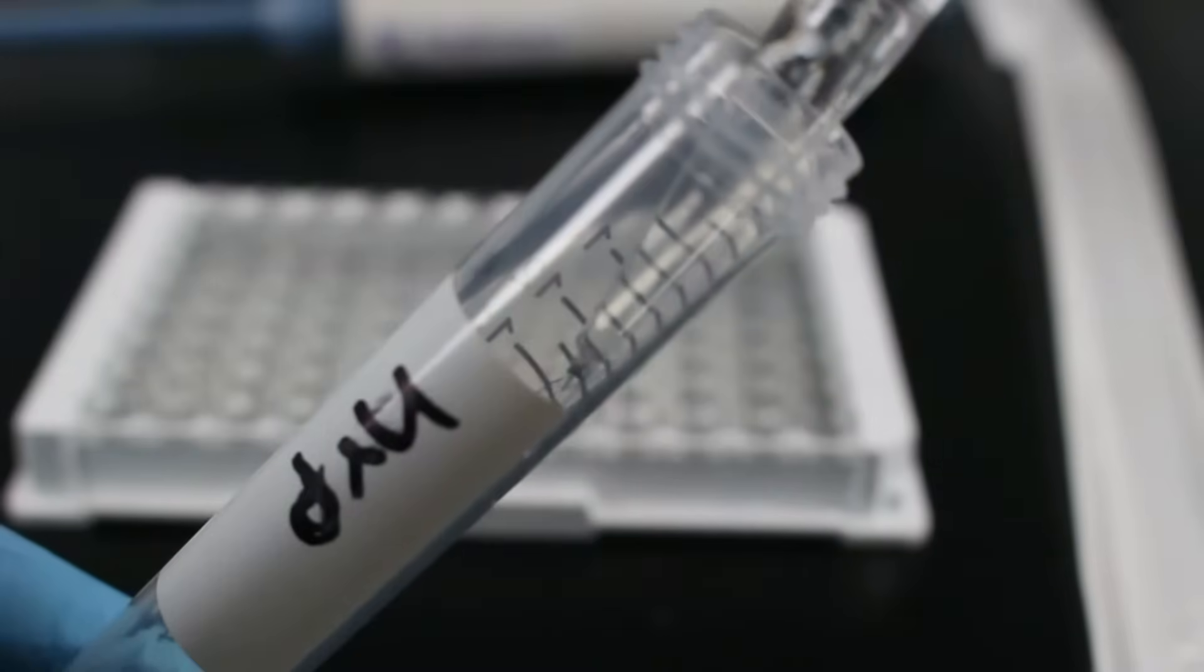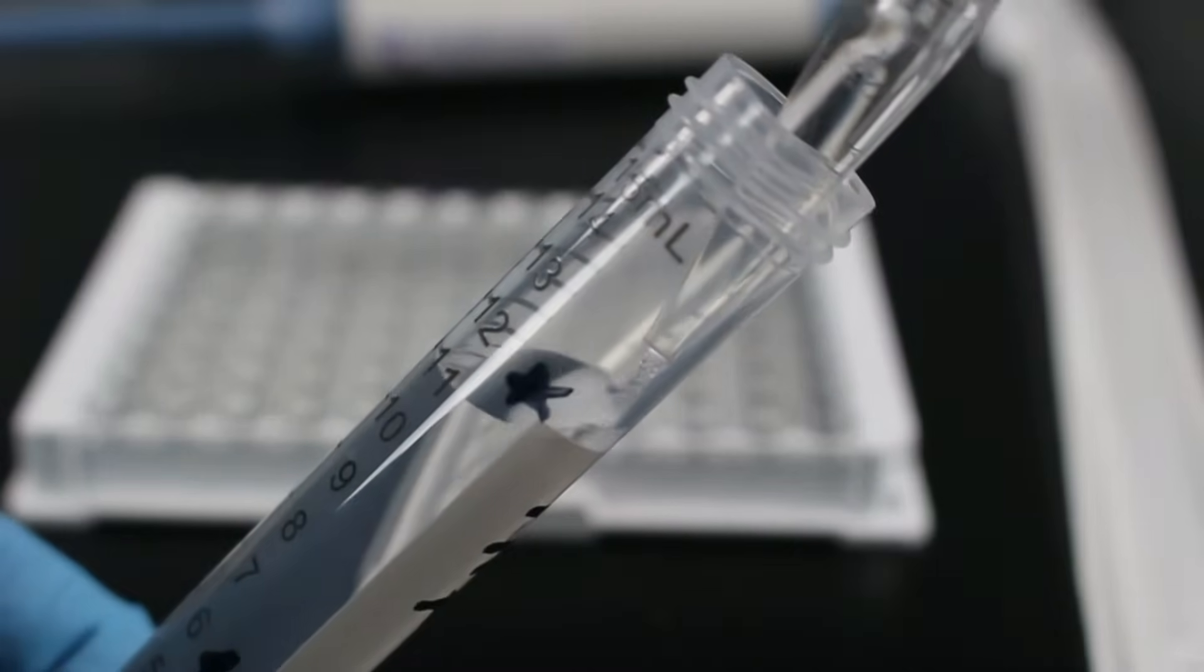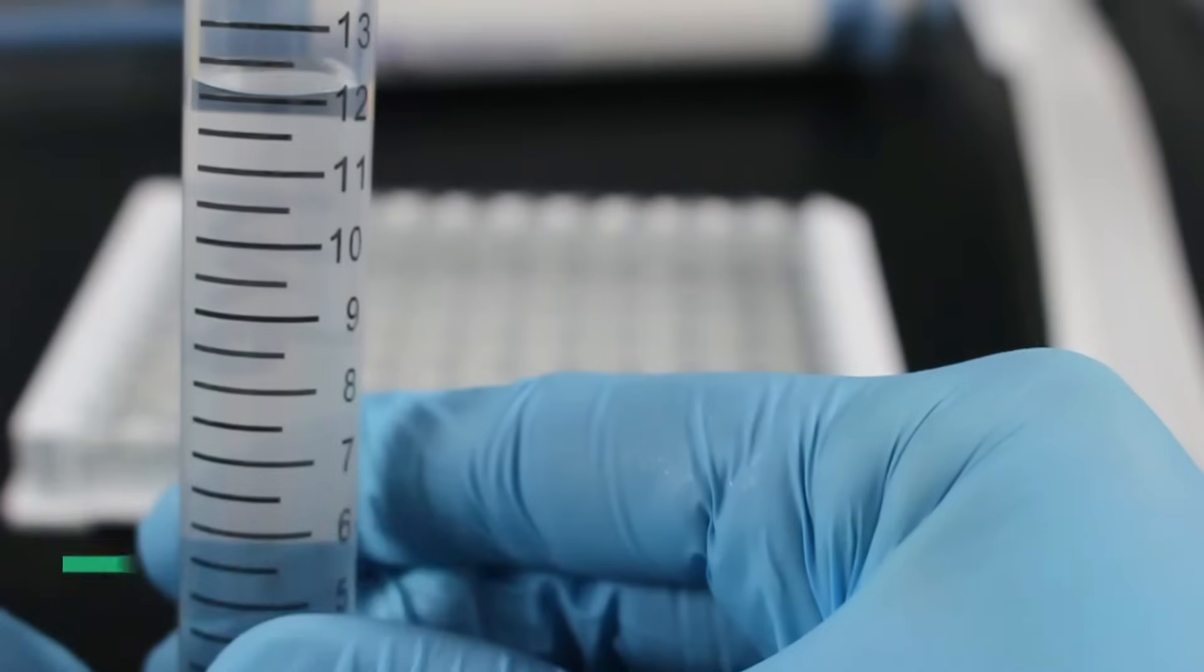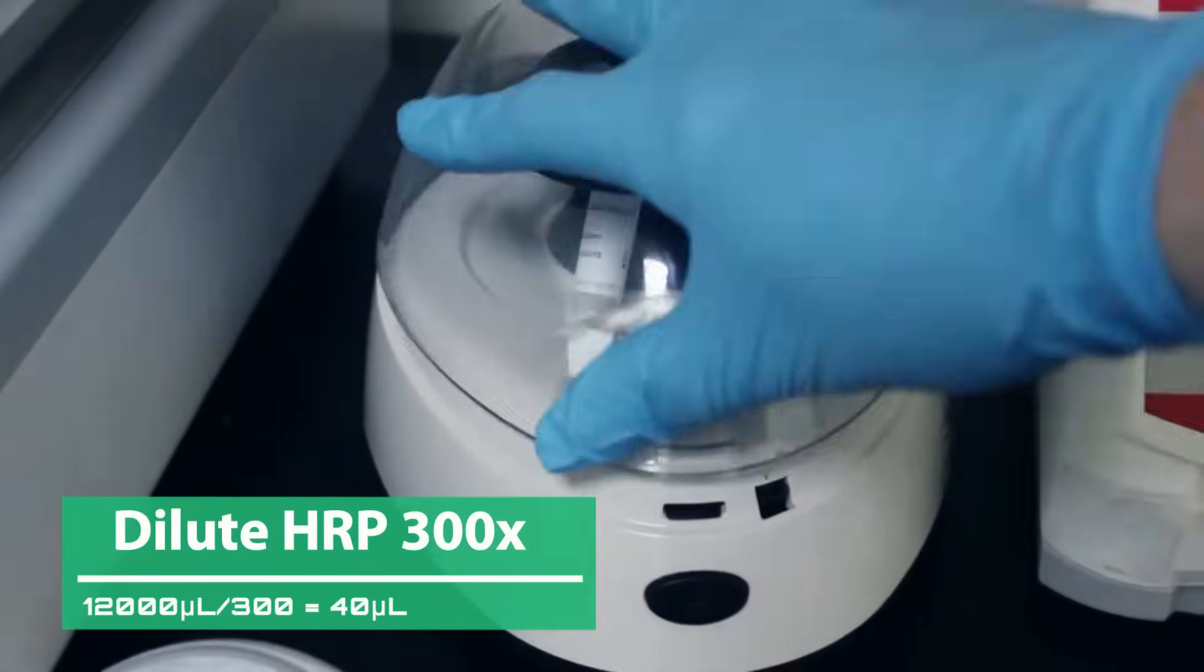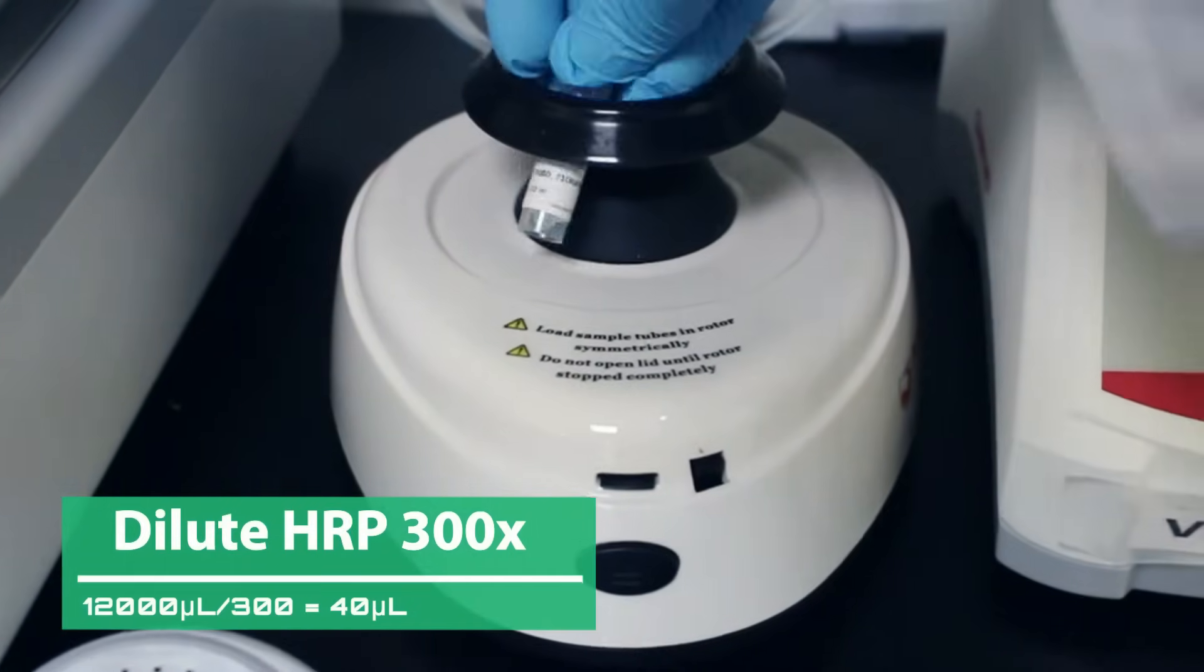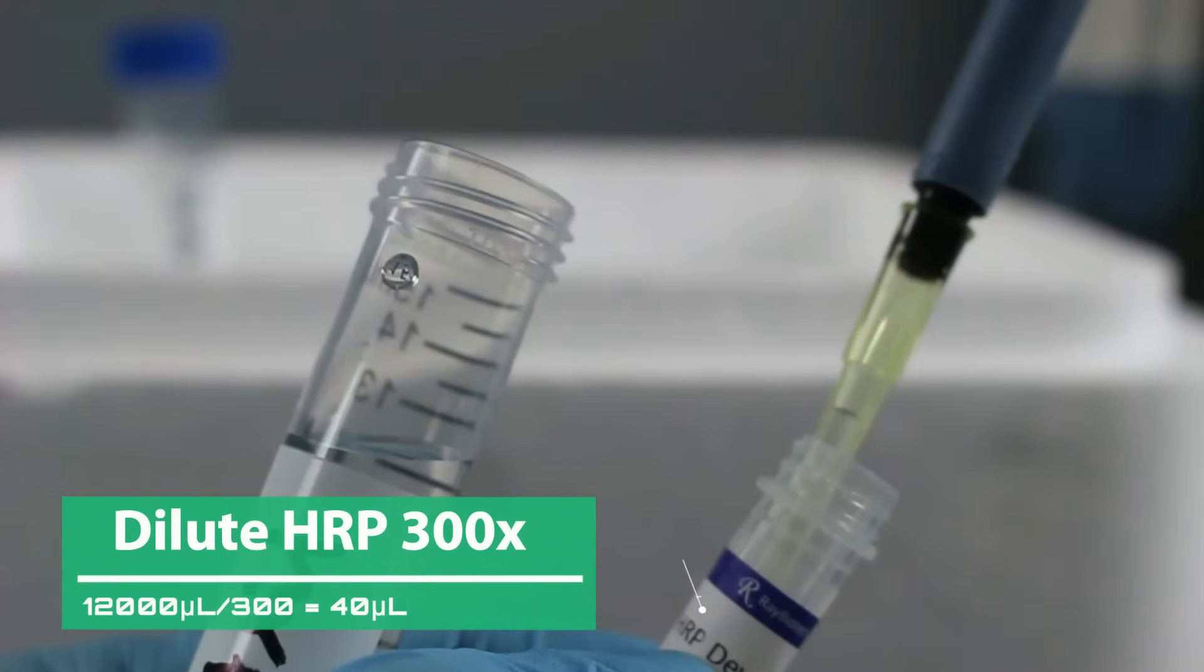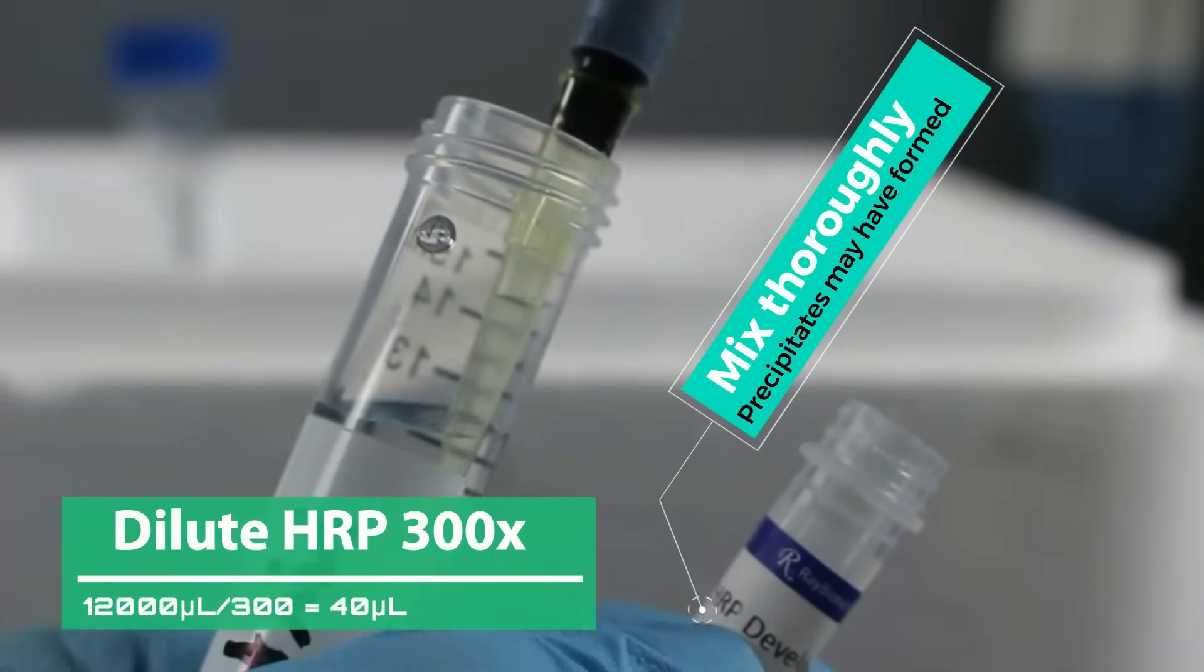The total volume of HRP is calculated in the same way as the detection antibody. We are using a full plate, so we will use 12 milliliters of ADB. Add 100 microliters to each well. Spin down and mix the HRP prior to use. Our target specific HRP dilution is 300x, so we will add 40 microliters.